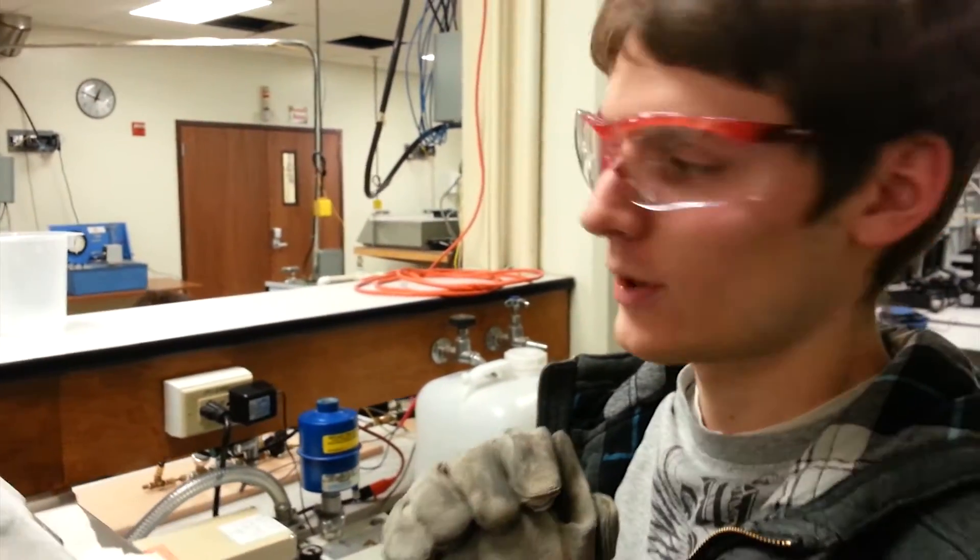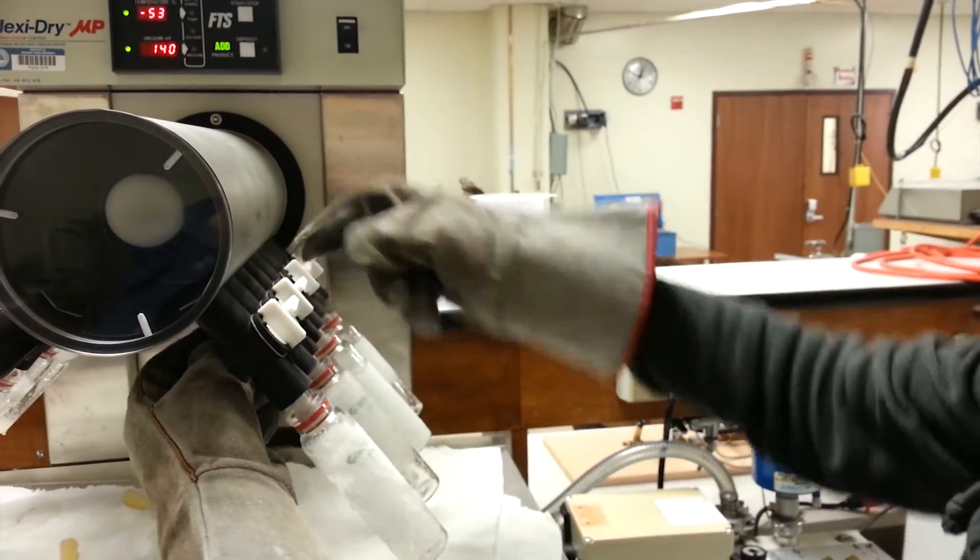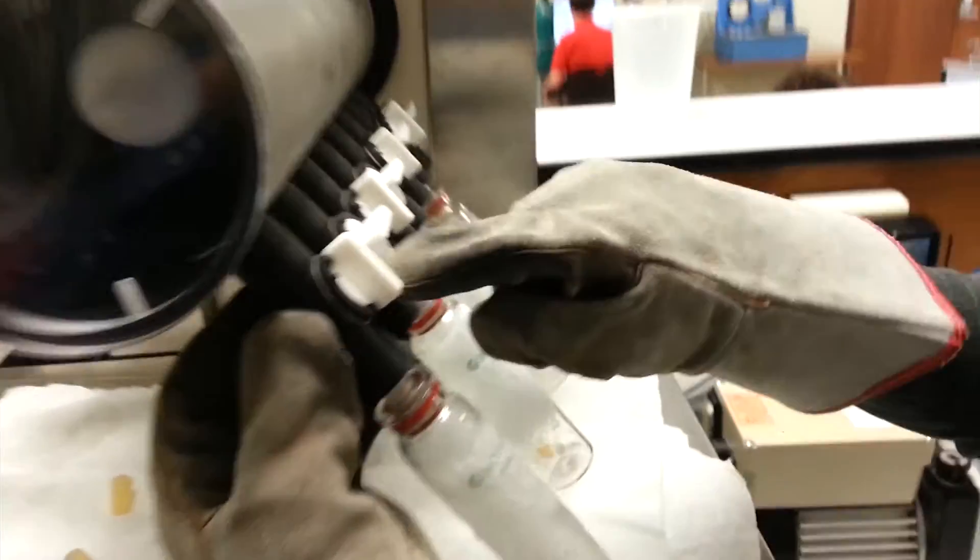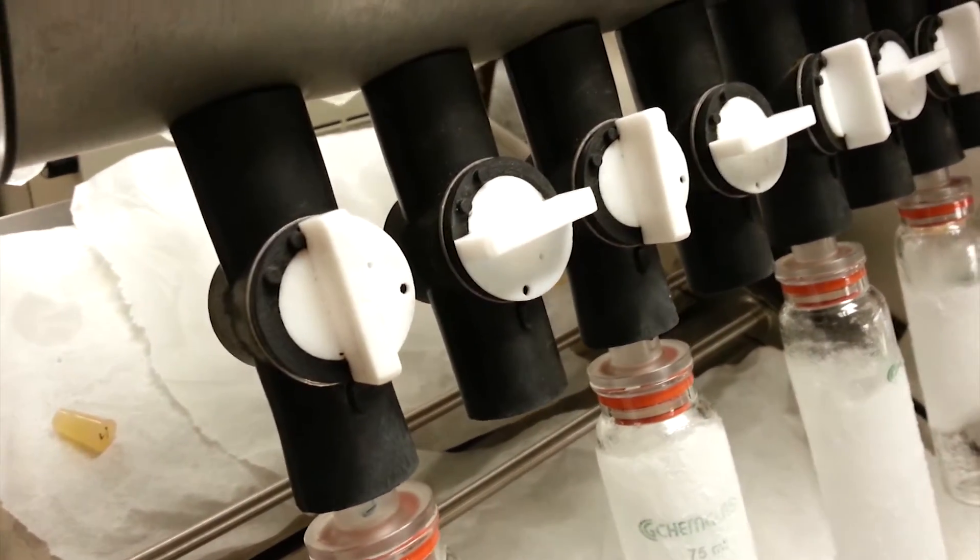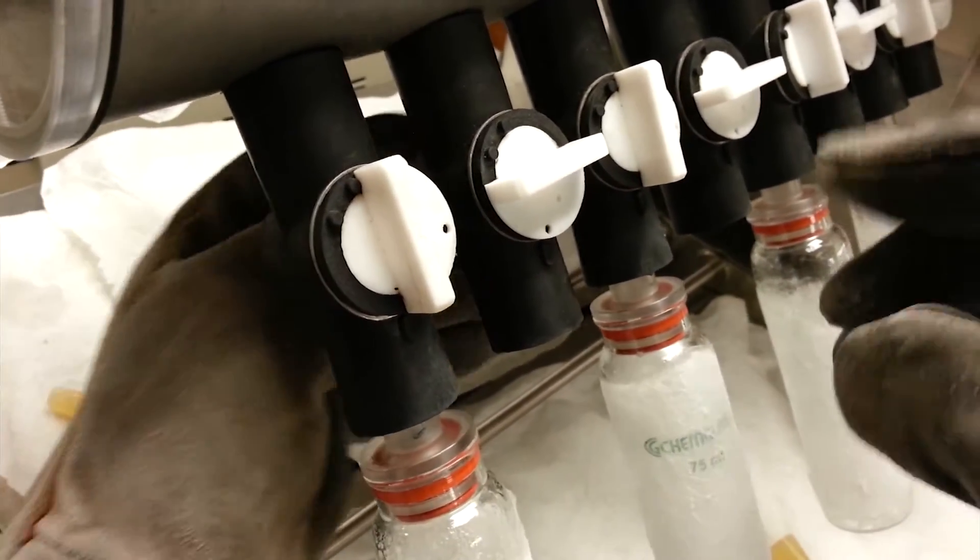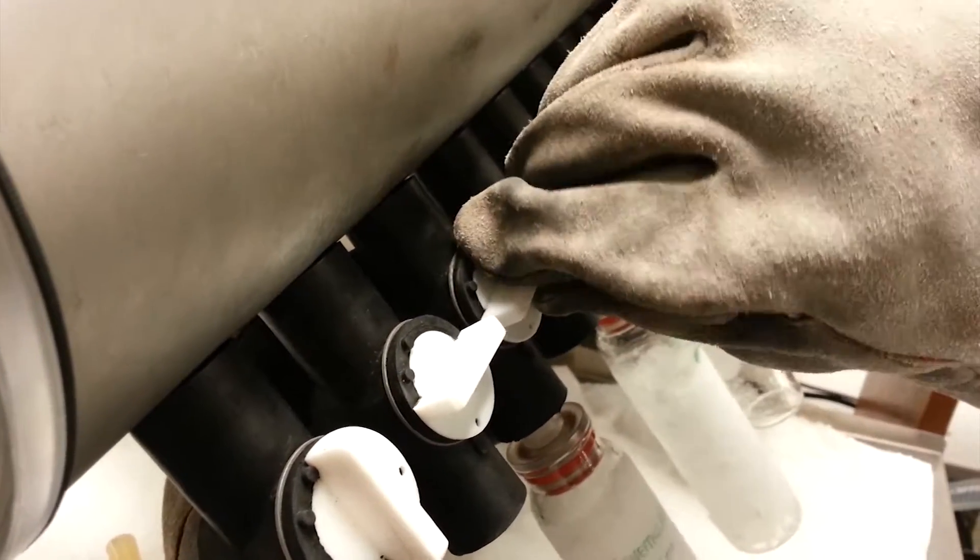Now one thing that you have to make sure as well when you're taking these off is you never want to turn this vial up with this whole part right here up on the top. Otherwise, that'll mess with the vacuum and I think it opens it up to the atmosphere. So whenever you pull one off, you want to turn that down and that'll close it off to the sample.